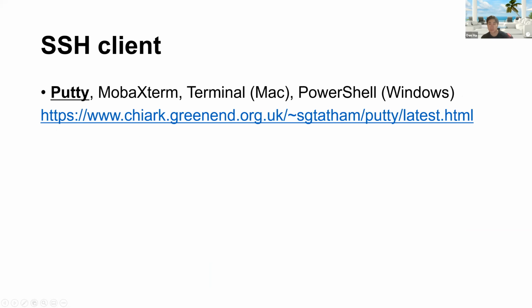To connect to Hoffman2, you need an SSH client. If you're using Mac, you can just use the terminal, or PowerShell for Windows, but I prefer to use PuTTY because it's kind of an old-school method.